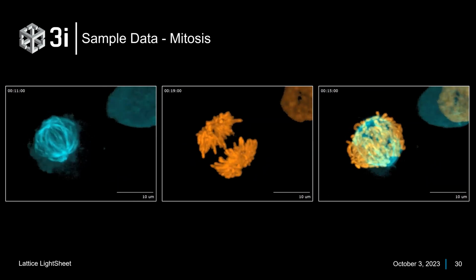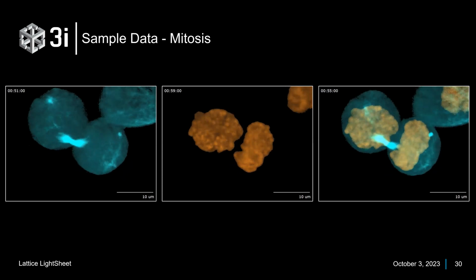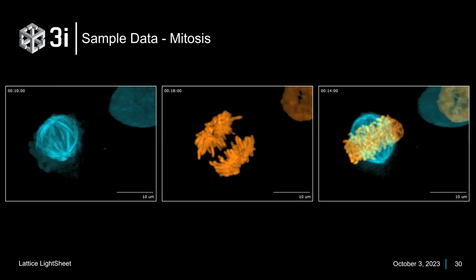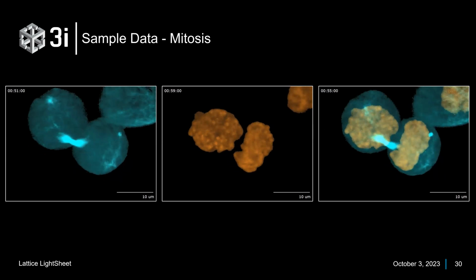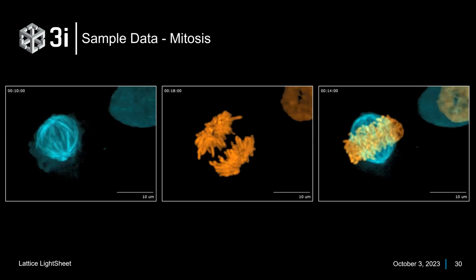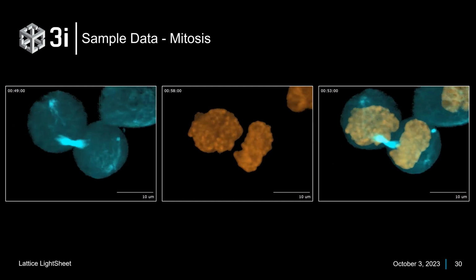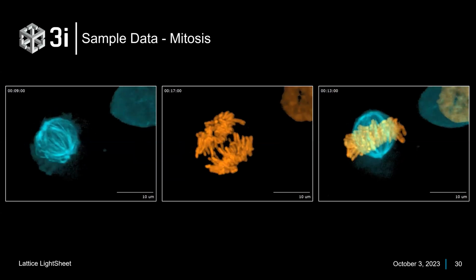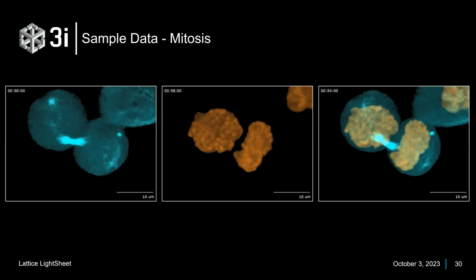How good is this case? You can modify it. I'll start with that first. So you can treat the cover slip with whatever you want. They do have to be 5 millimeters. If you make them larger than that, you hit the objectives. If you hit the objectives with something rigid, you could break the objectives. The objectives are very, very expensive.